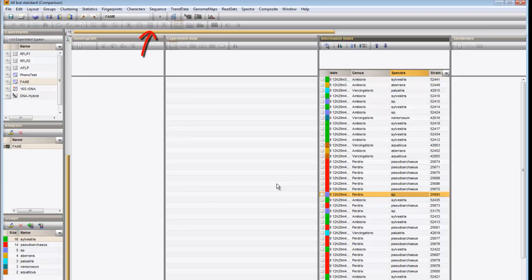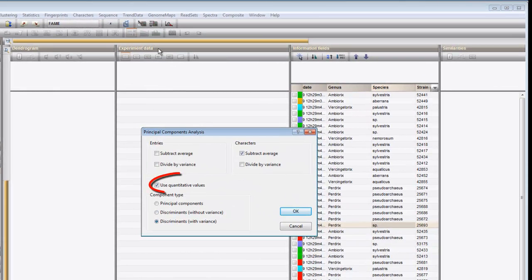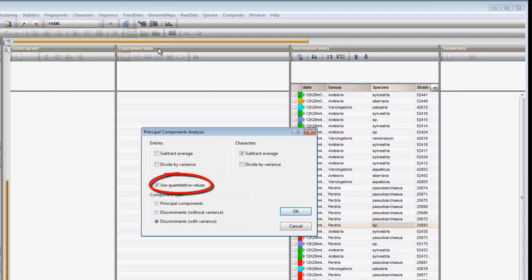Press this button to call the PCA dialog box. By default, Use quantitative values is checked, and if the technique provides quantitative information, one will normally want to use this information for the PCA calculation.